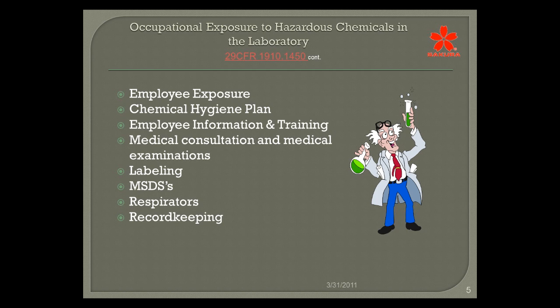So employee exposure. This is where we discuss permissible exposure limits. Hopefully you've heard that term before. It's called a PEL, and it's a generic laboratory regulatory limit on the amount or concentration of a substance in the air over a determined period of time, and can include maximum allowable concentration in the air for any exposure. So typically it's 8 hours a day, 40 hours a week, 52 weeks a year, and that's what they determine is a permissible exposure limit.